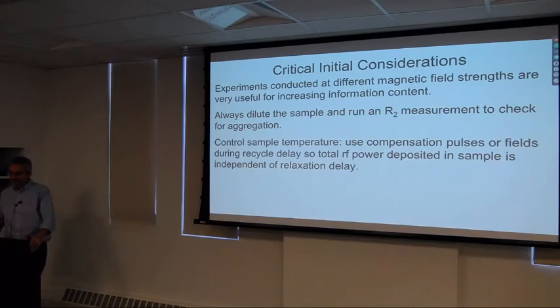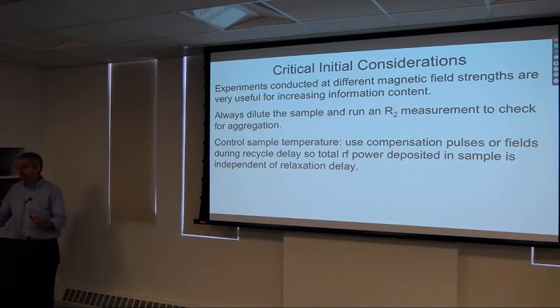Many of the processes are going to be very temperature dependent. Overall rotational tumbling, for example, is very temperature dependent because the viscosity of water is very temperature dependent. The chemical exchange timescale processes will be temperature dependent because these are transitions over some barrier. So control of the temperature of the sample is very important.